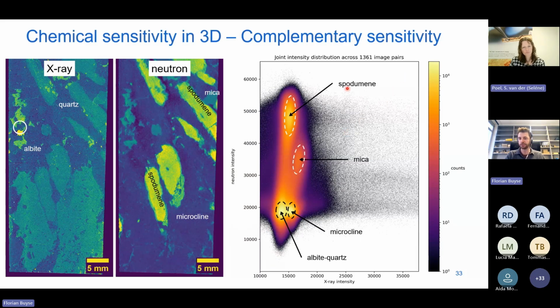You will see different trends as well to identify those small differences for the minerals. So not only for these K edges, but it's a bit similar to those. You will see some point clouds for each mineral that can be differentiated using the spectral CT technique.